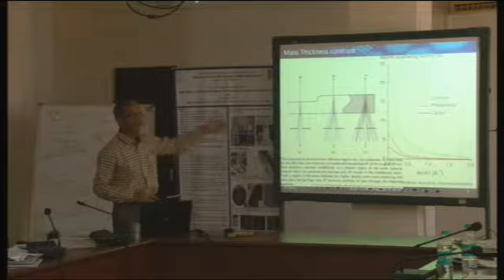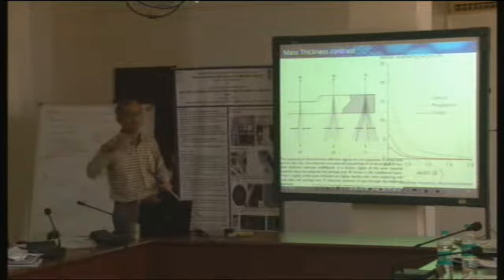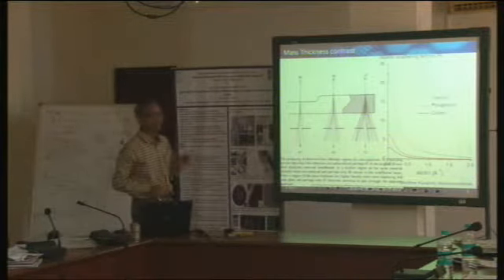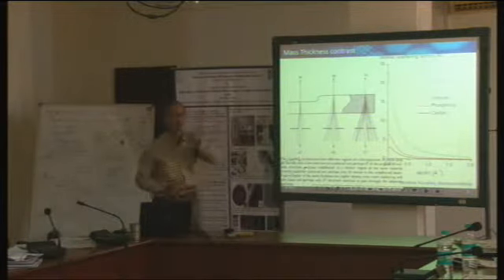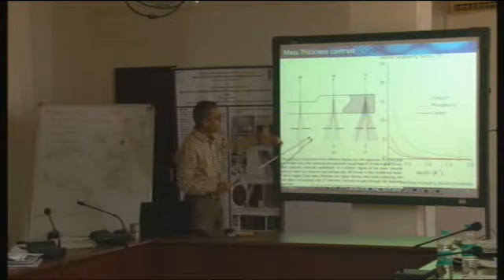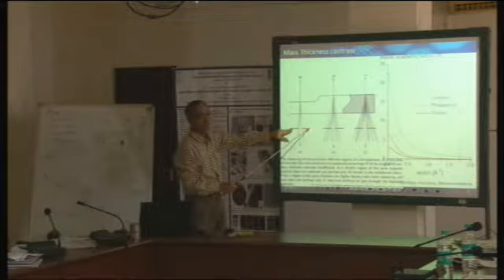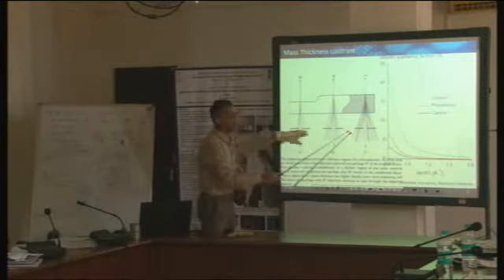Assume it's bright field. For dark field, it will be exactly complementary. So we don't necessarily have to discuss the dark field contrast especially, but we'll only understand the bright field imaging. And what was the case? In bright field microscopy there was that objective aperture which sits in the back focal plane of the objective lens. So no lens etc. is shown here, but the aperture is shown. In fact, I took this from this book. In that book they didn't explicitly mention the apertures, but I put it in myself for the sake of understanding. So we have the apertures, let us say, we have kept them.